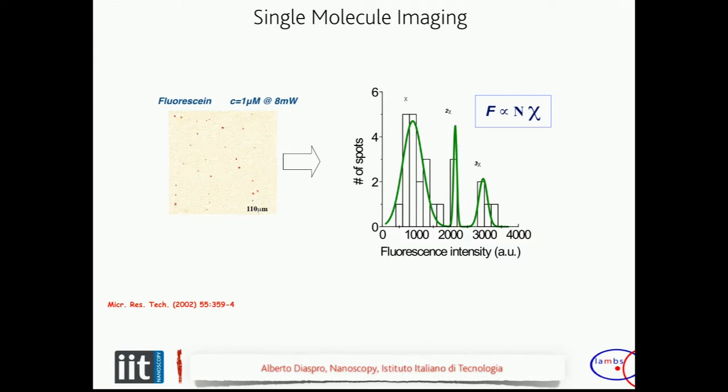But do you have another possibility for understanding that, for example, I don't know if it's one, but this one is a single molecule. What could you do for being sure? Because a single molecule will be the key word for the super-resolution method, but not only. Also for learning something by single molecules. And you want to be sure that you are dealing with a single molecule.